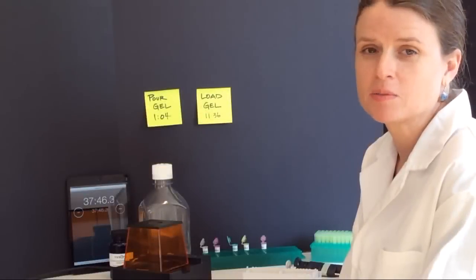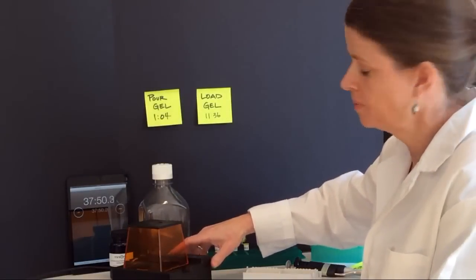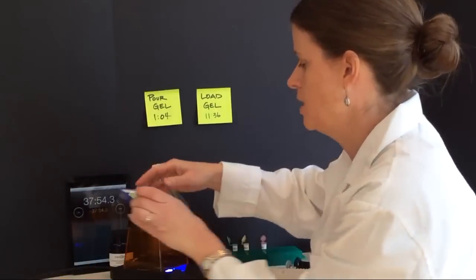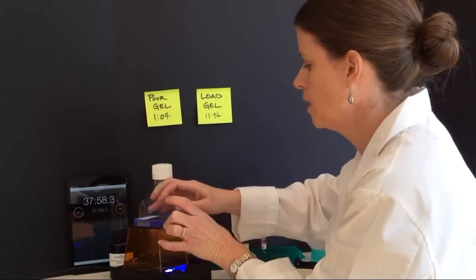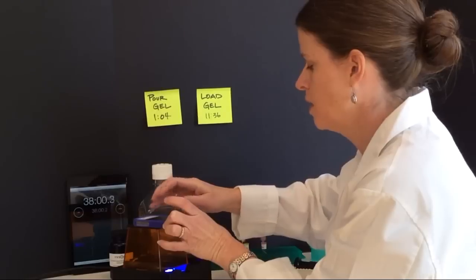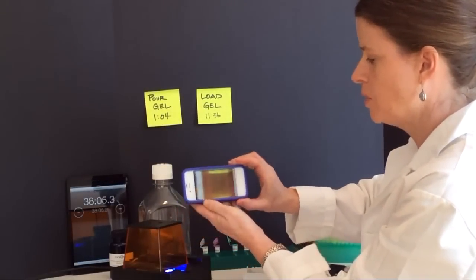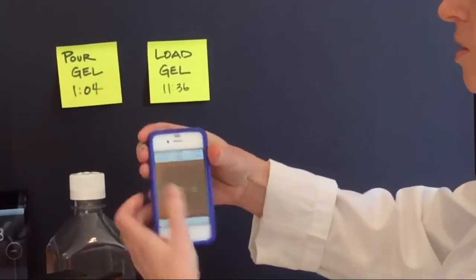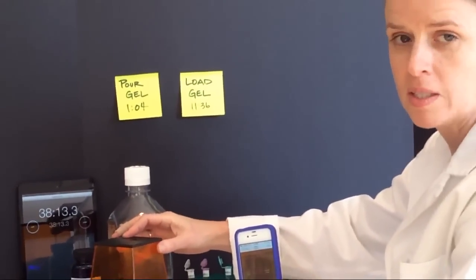Our gel's been running for about 25 minutes and we're ready to stop and take our final picture. I'm going to turn on my light one last time and take my camera and document the results. Students will be able to use this image to analyze their results or they can also visualize the results directly using the Mini One system.